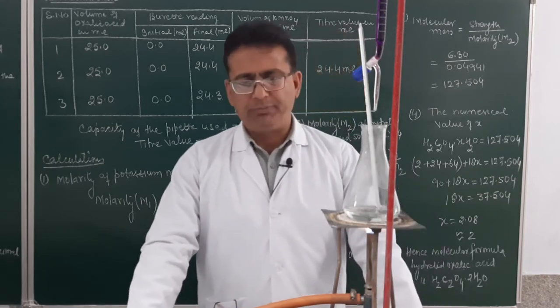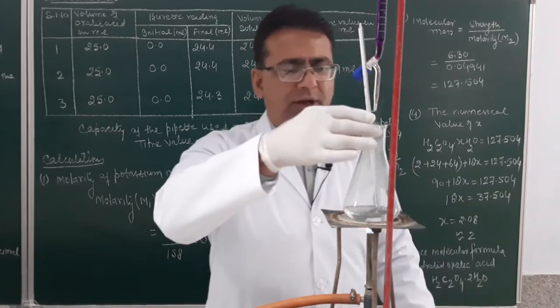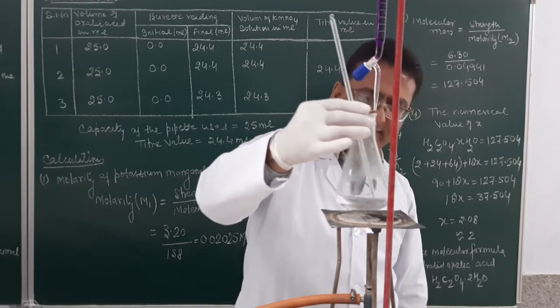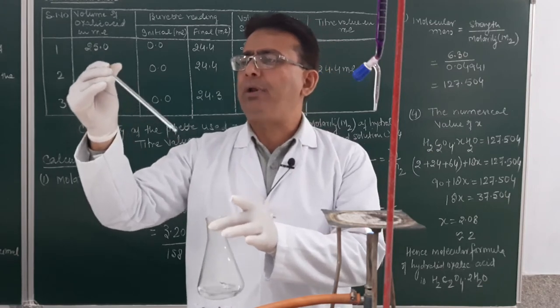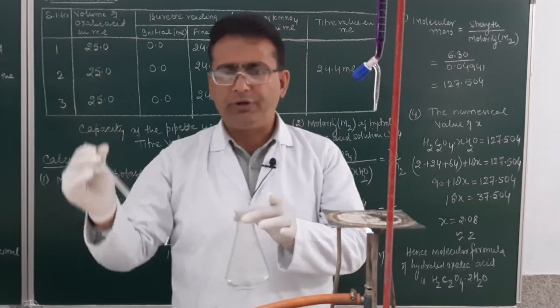So we are heating it up. So hopefully you must have been understanding. So now student, you can see over here, the first bubble appears at the bottom of this, and this gets heated up to the temperature of about 60 degrees C. Is it clear?